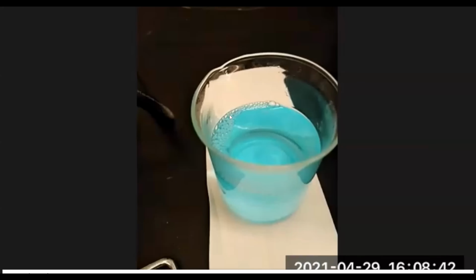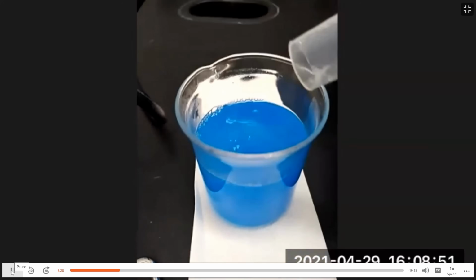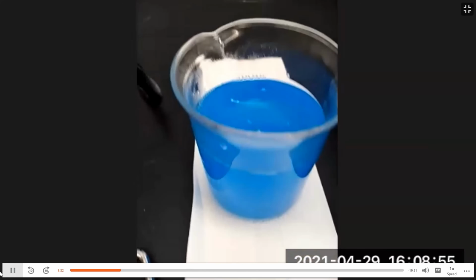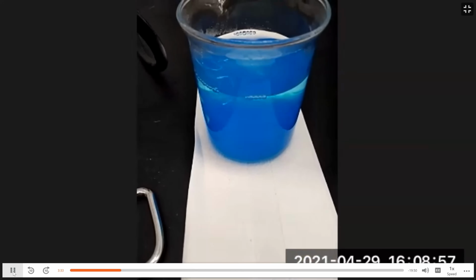And it looks something like this. So again, once all of the copper has reacted, you get this blue color solution. Then we add DI water to the beaker. And in the second step, remember, that's when we add the aqueous sodium hydroxide shown here, and we get this blue precipitate. So this is step 2.